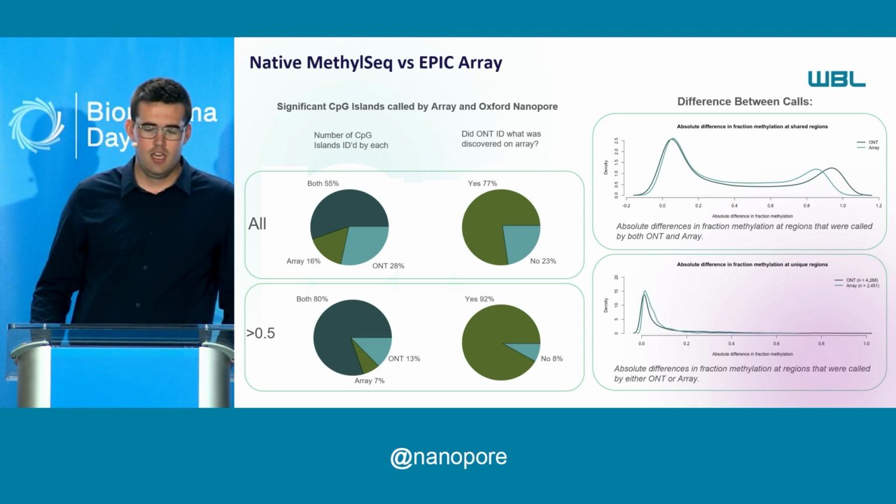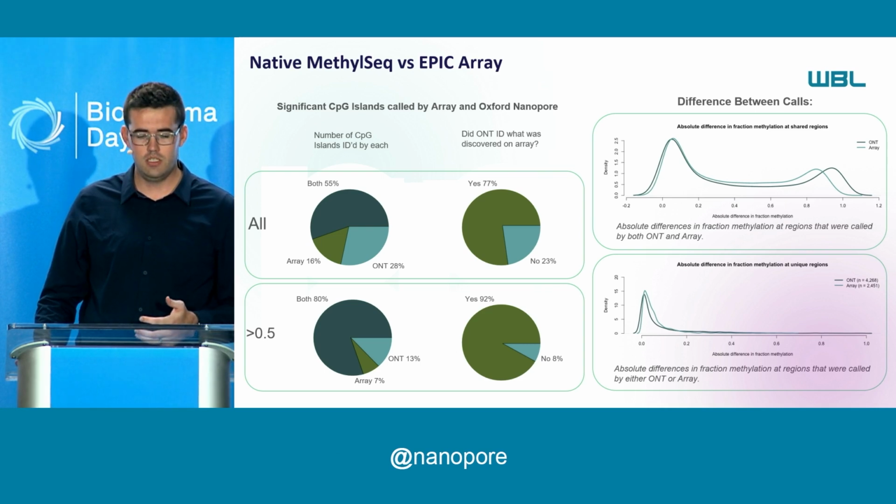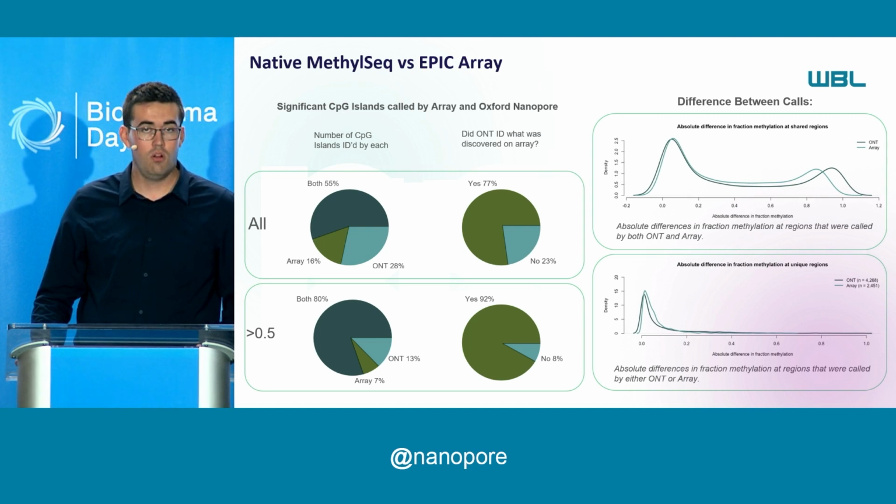To make it so you could compare them, we had to limit the regions we're utilizing in this analysis. If you're familiar with the Illumina array, it covers largely CpG islands. That's where it's biased towards. So this is just a CpG island analysis to show what Nanopore covers for CpG islands, what Illumina covers, and confirmation that we are seeing the same data and better data. If you take all the CpG islands present in the genome, both the EPIC array and our platform are able to cover 55% of the same CpG islands. There are 16% of the array that we weren't covering at our 5x coverage, so we're upping that now to understand what coverage we need to cover all of the CpG islands we may have been missing before. But there's 28% of the CpG islands that we covered that the Illumina array did not.